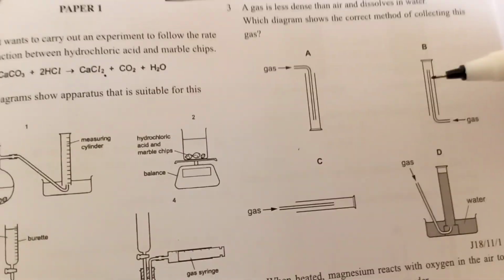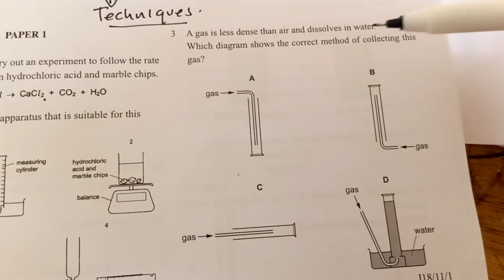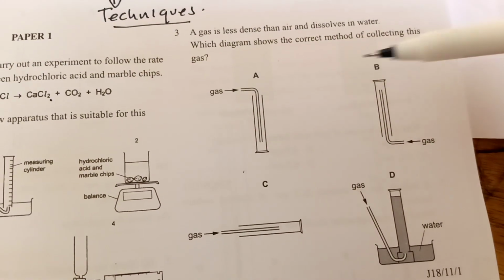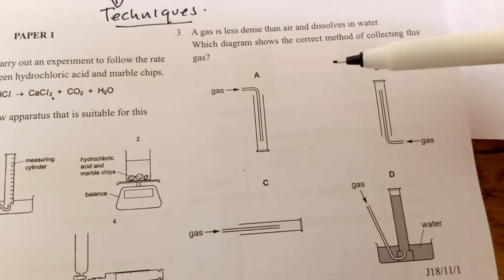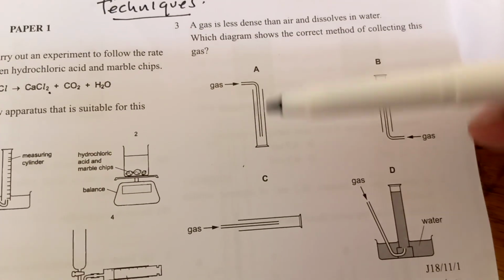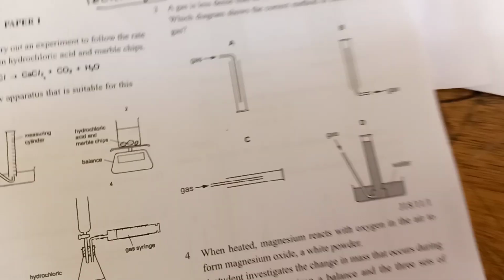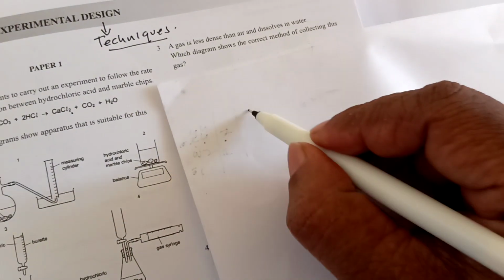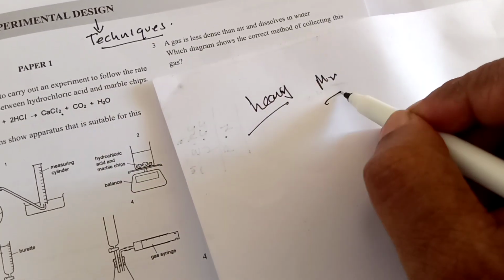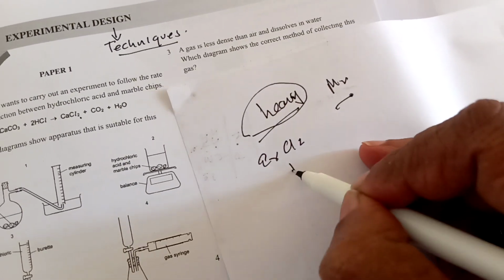Now let us see this one. A gas is less dense than air and dissolves in water. Which diagram shows the correct method of collecting the gas? Now, this apparatus is used to collect a heavy gas, a gas with a high molecular mass. A heavy gas, for example chlorine, HCl.